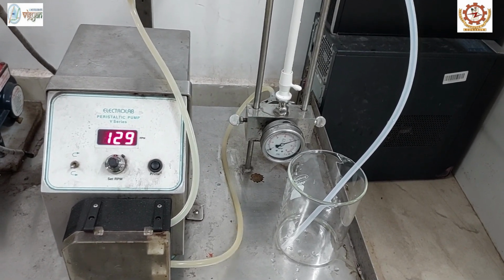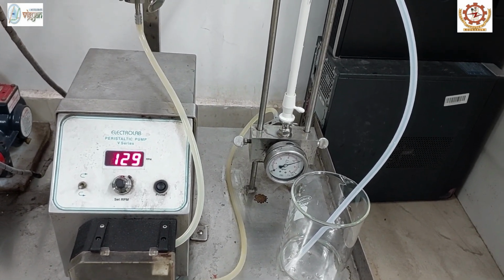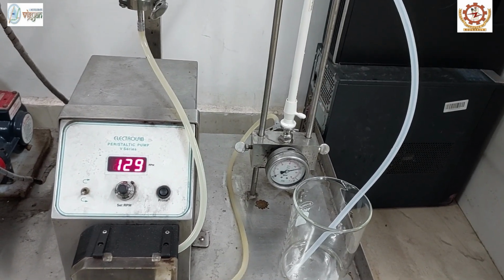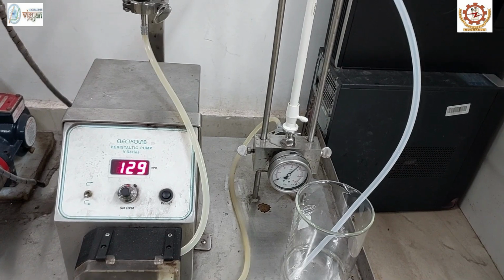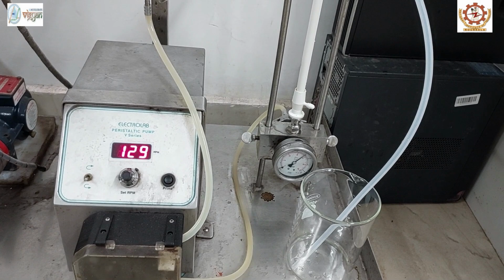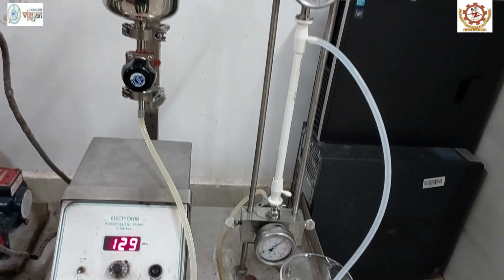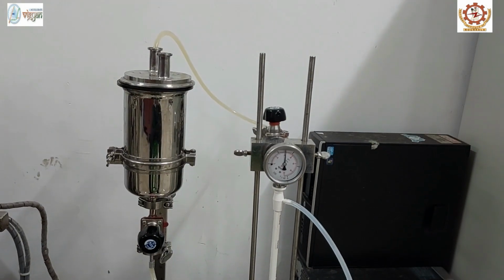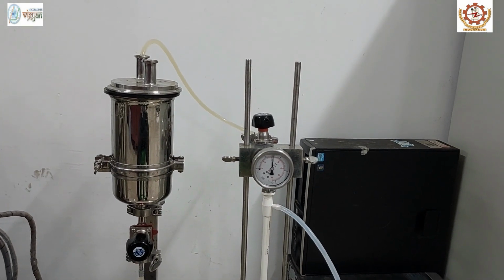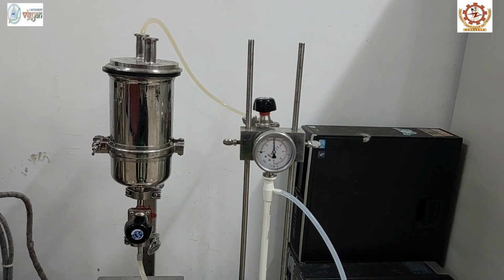Biofouling is associated with the formation of biofilm on the membrane surface due to the activity of organisms such as fungi, bacteria, or algae. These biofilms produce biopolymers such as amino acids, proteins, and polysaccharides, which cause fouling. These kinds of fouling are also known as microbial fouling.